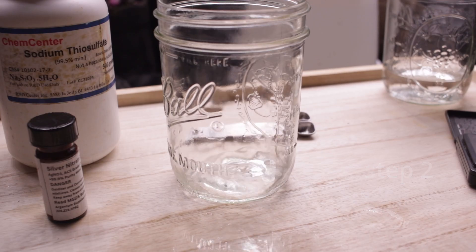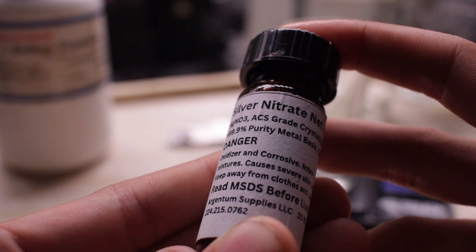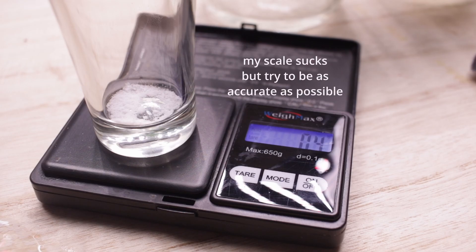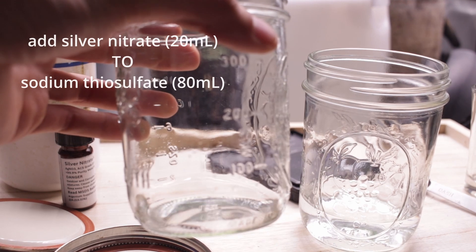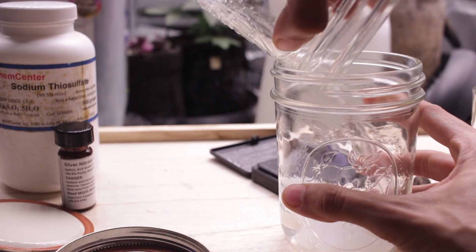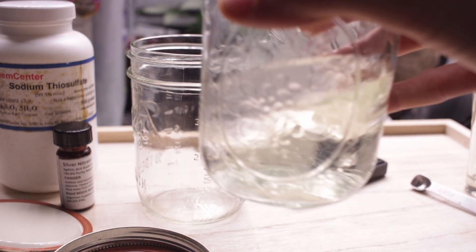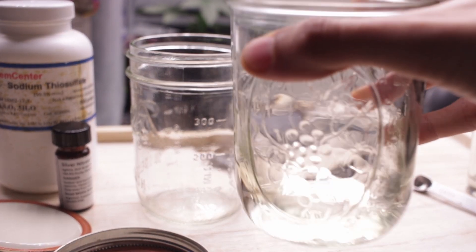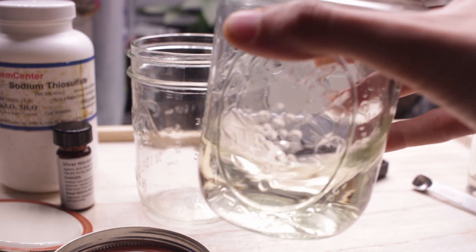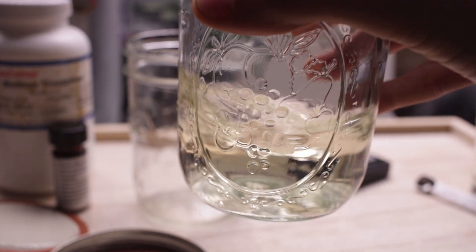Step two: in a separate pure glass container, measure out 20 milliliters of distilled water and mix in 0.34 grams of silver nitrate. Step three: add the silver nitrate solution to the sodium thiosulfate solution and stir instantly and rapidly — do not let this reaction sit. Congratulations, this STS solution has been created at a concentration of 20 millimoles.